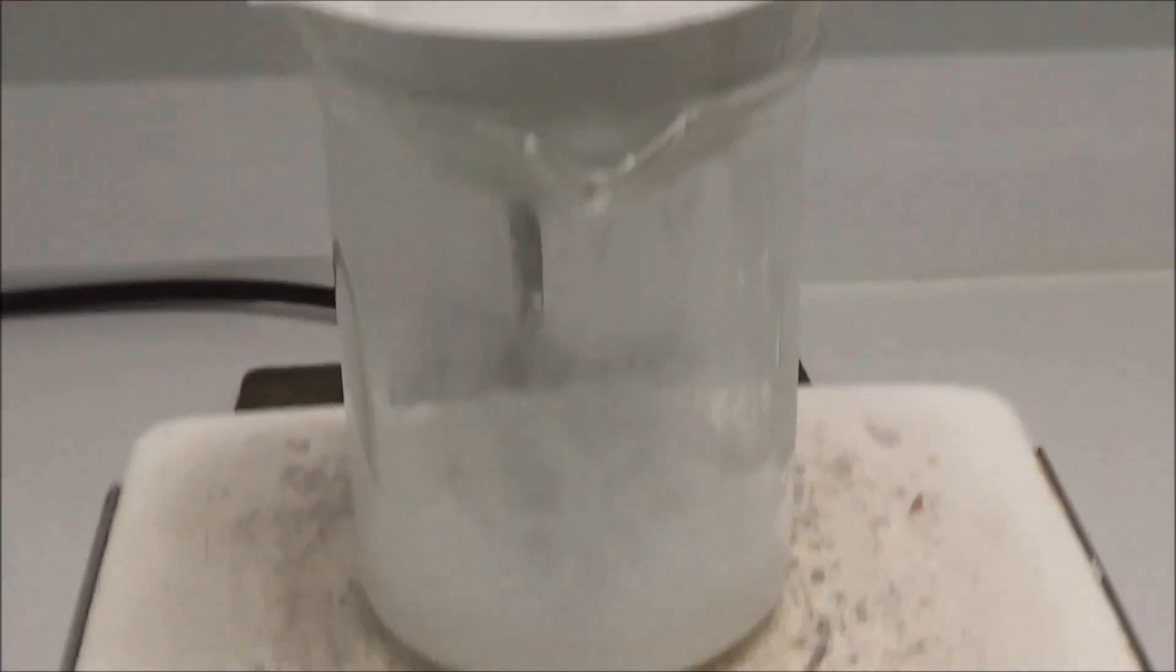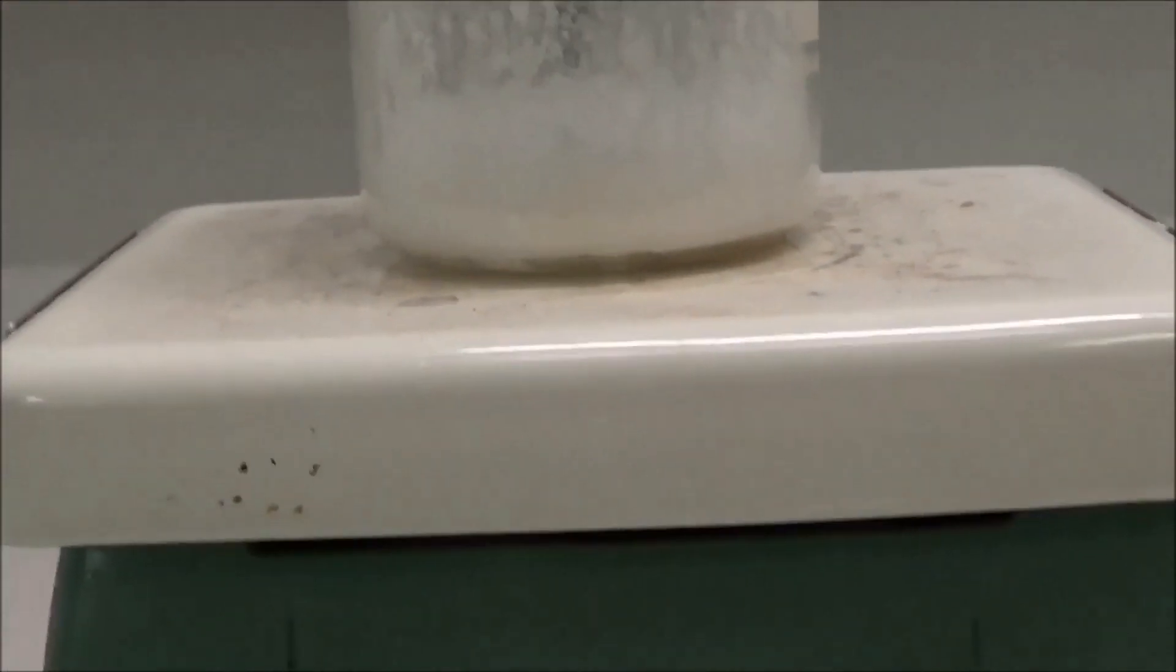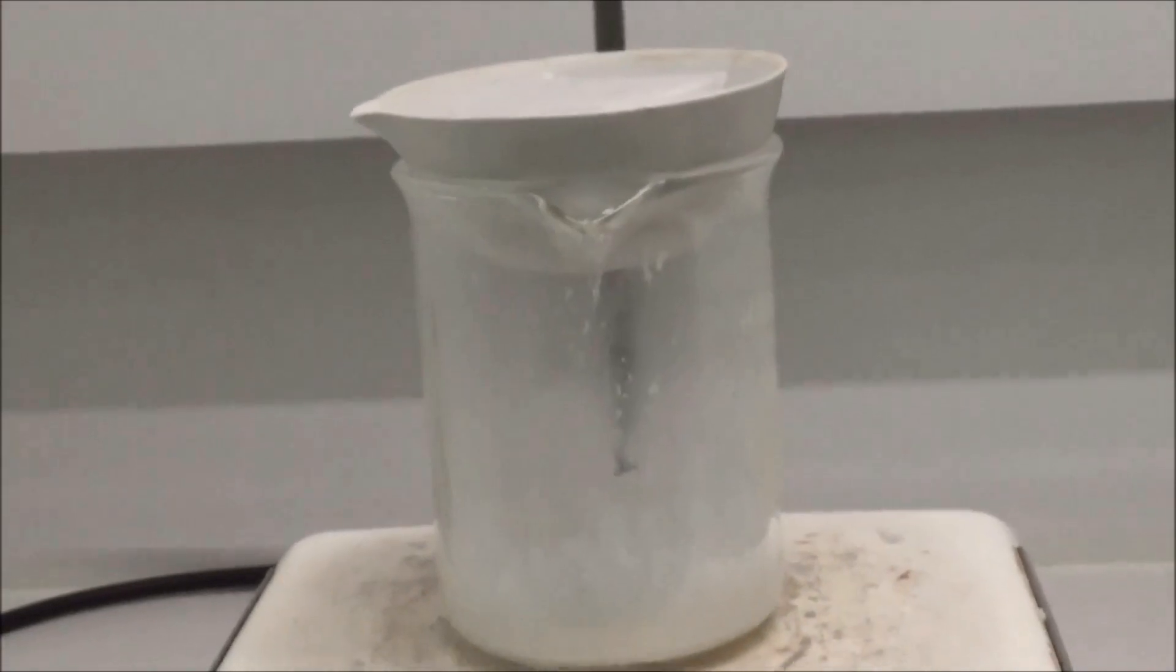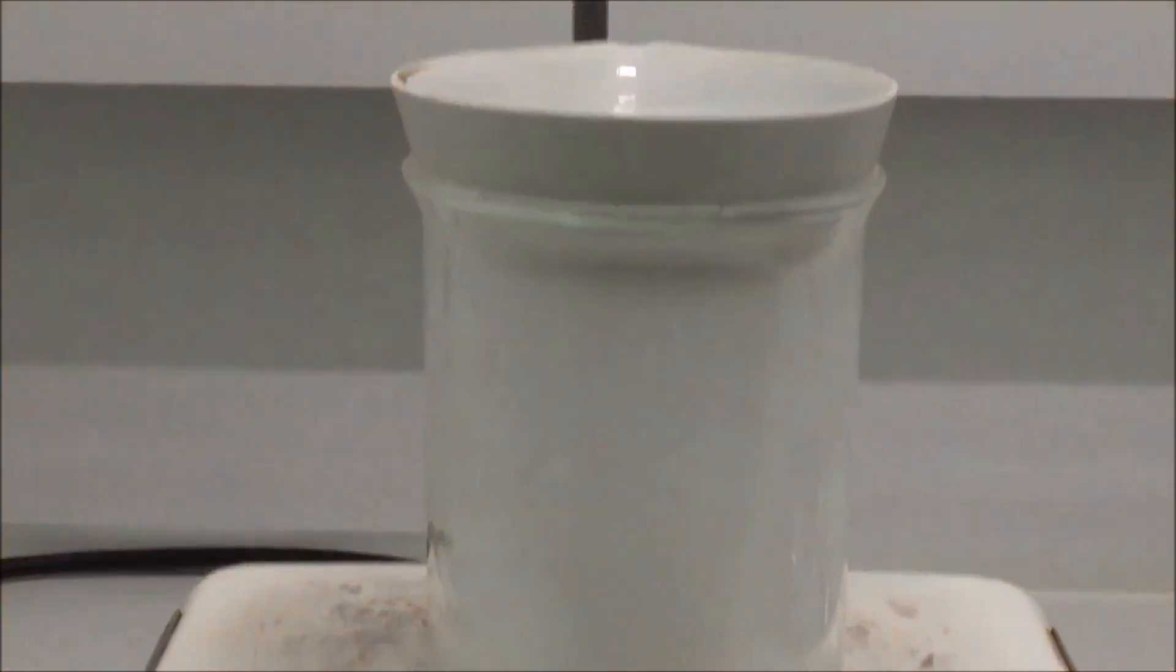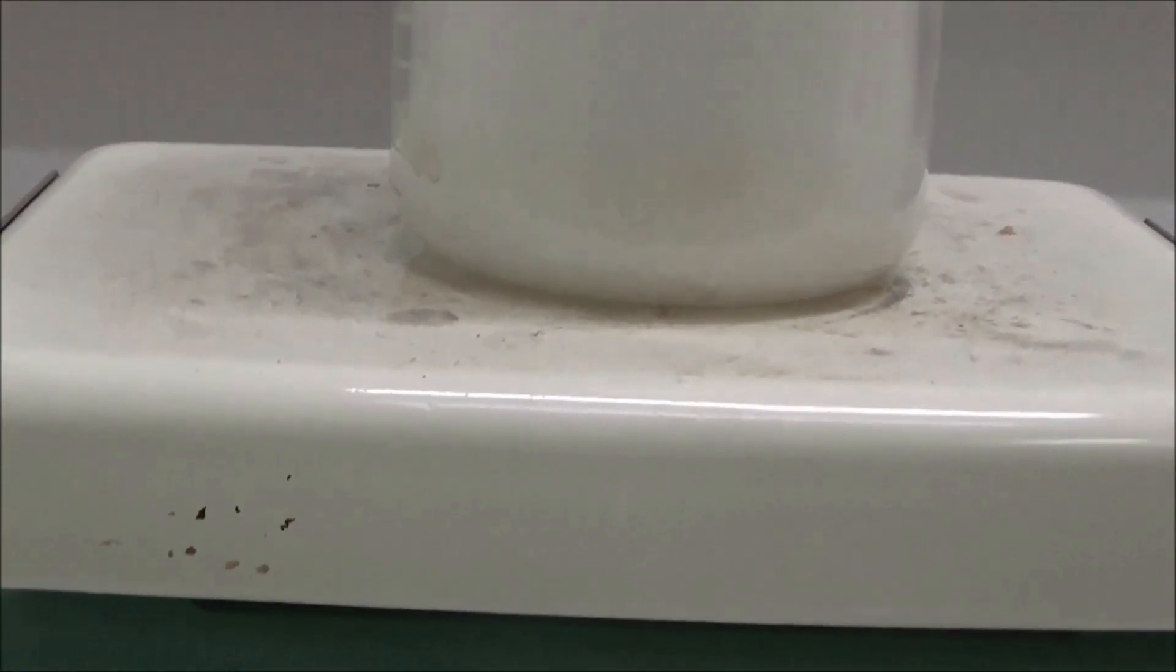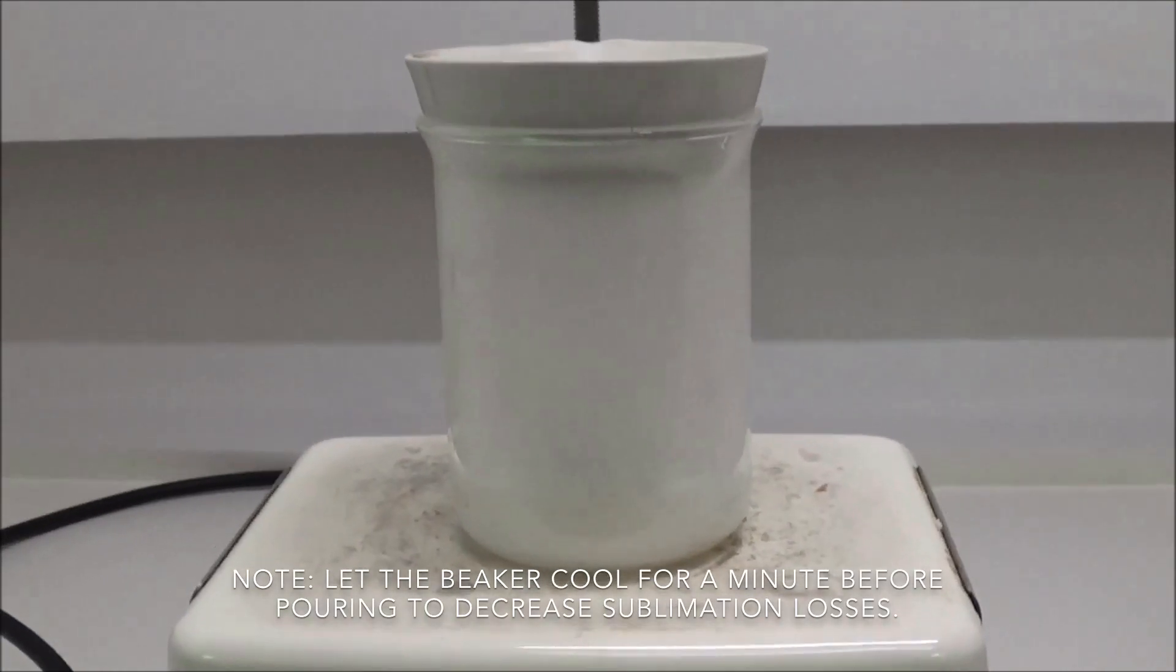After about 30 minutes, we reached this state. Water was no longer being emitted. An evaporating dish was placed on top to contain the subliming phthalic anhydride. The solid then melted and we poured it out onto the piece of aluminum foil to collect.